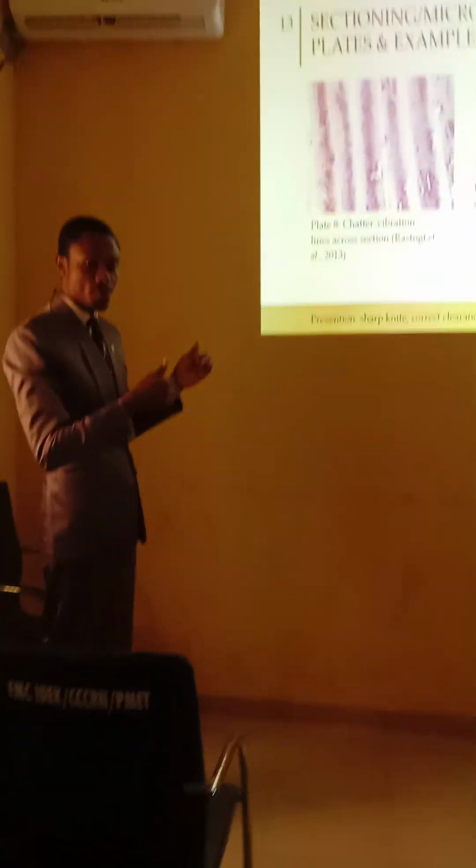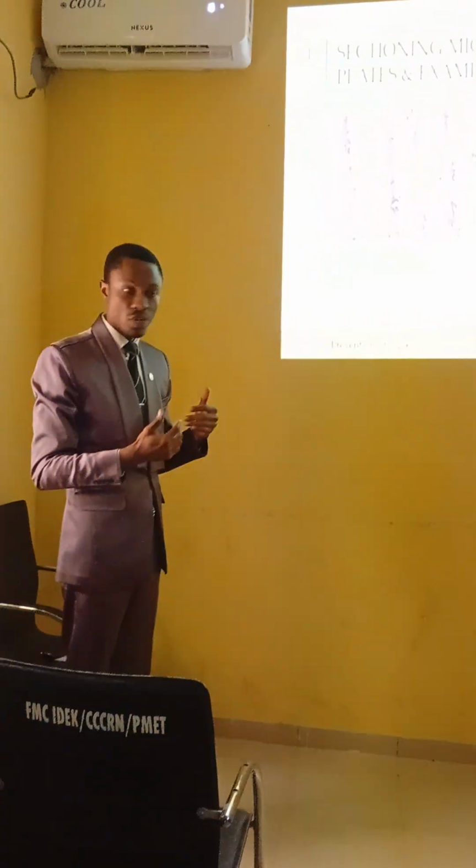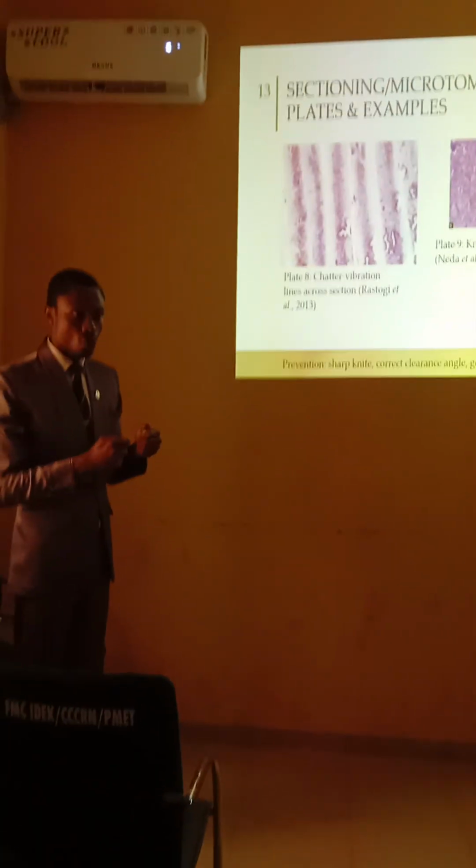The clearance angle used is between 3 degrees to 8 degrees. Some persons use 5 degrees. Then the block quality should be good for the section to come out well.